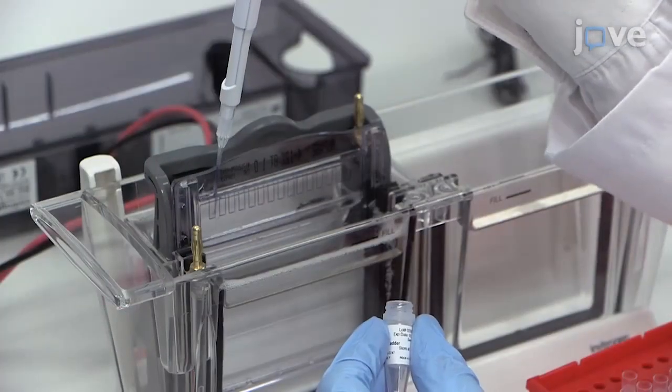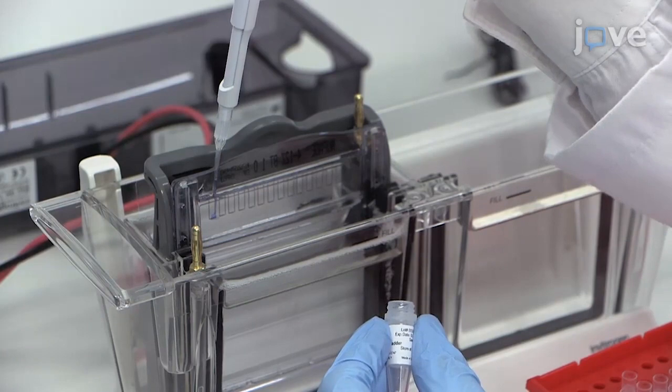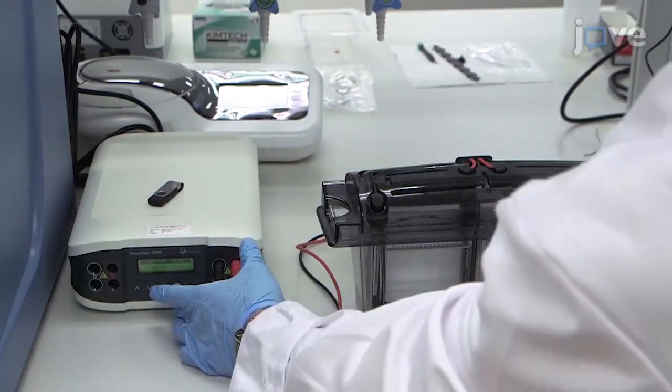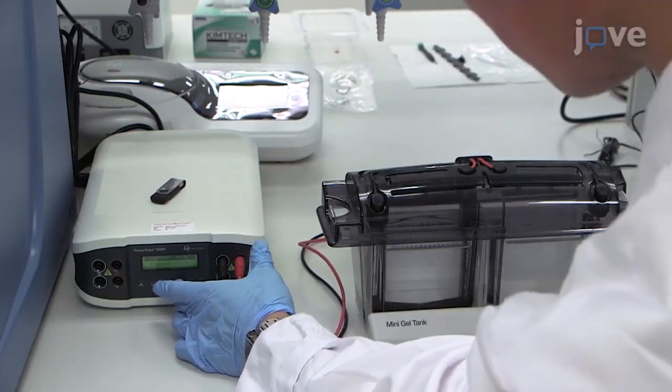Load the wells with the prepared protein sample. Then, run the gel at a constant voltage of 200 volts for 30 minutes.